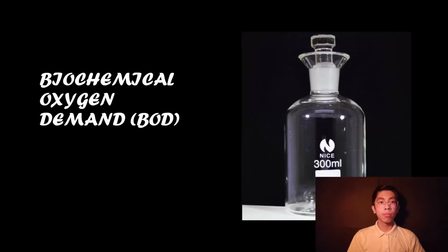Thank you. Hi, I'm Justin, and now I will continue our group presentation. I will show you the equipment we use in BOD and COD. So first is the BOD. BOD is also known as biochemical oxygen demand.